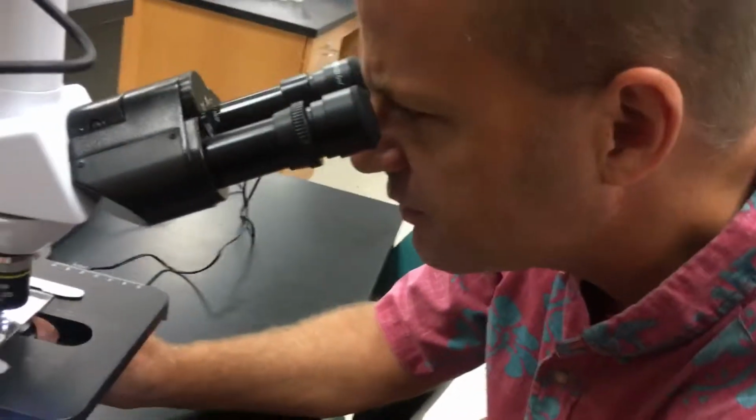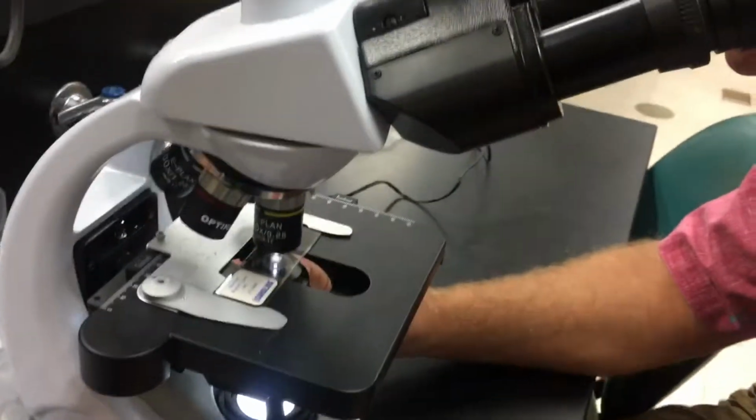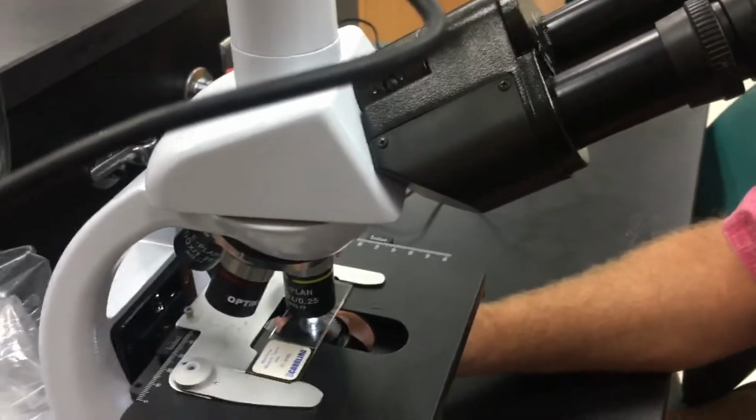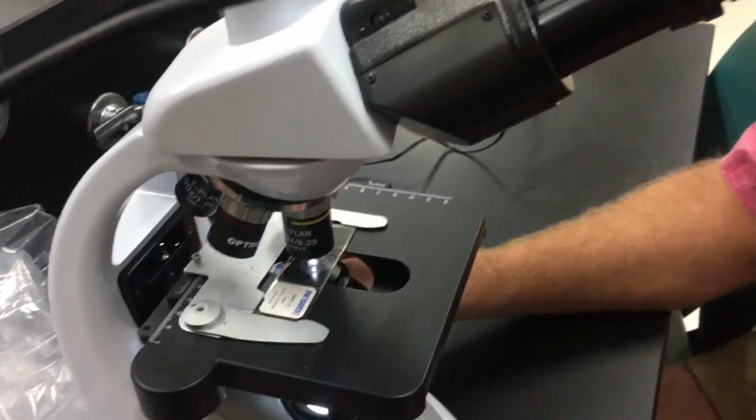Now, some of these are not the best slides, so it's not always great. That's probably the one we started on. It's going to be cardiac. So most of it is elongated smooth. The one we just saw is skeletal. And then let me grab another slide.